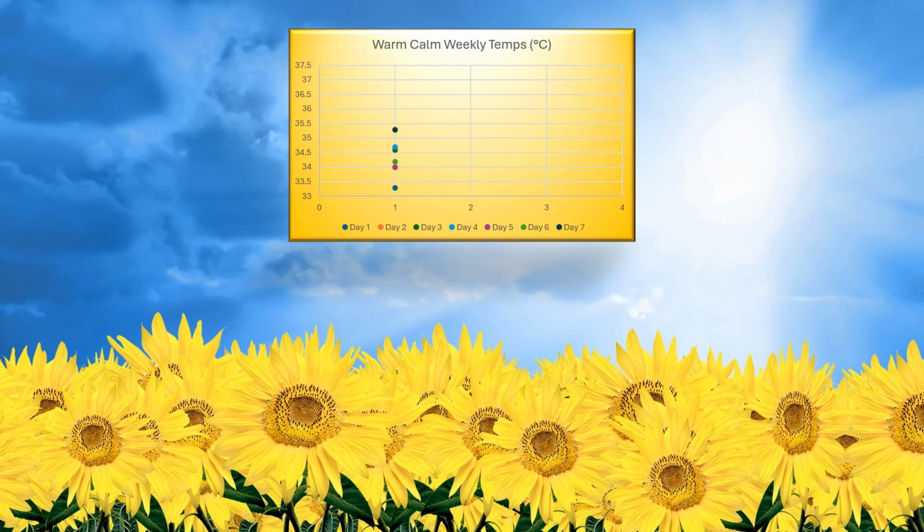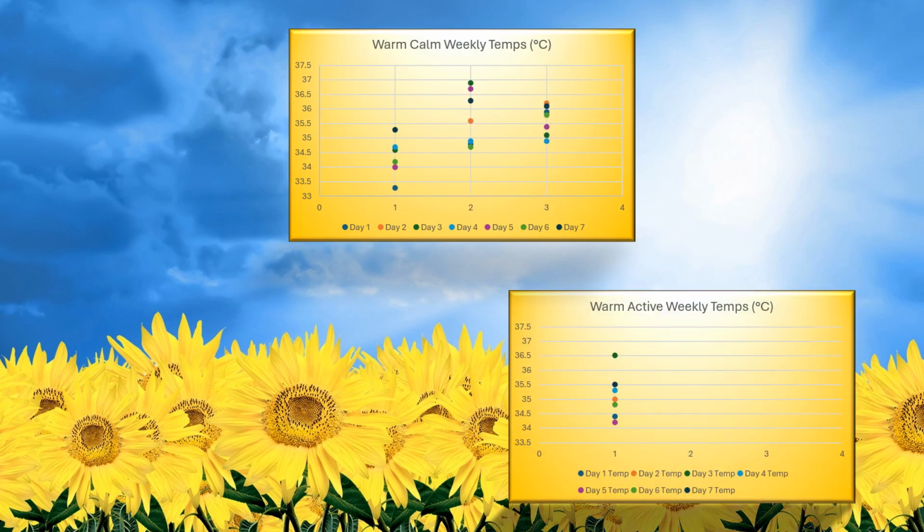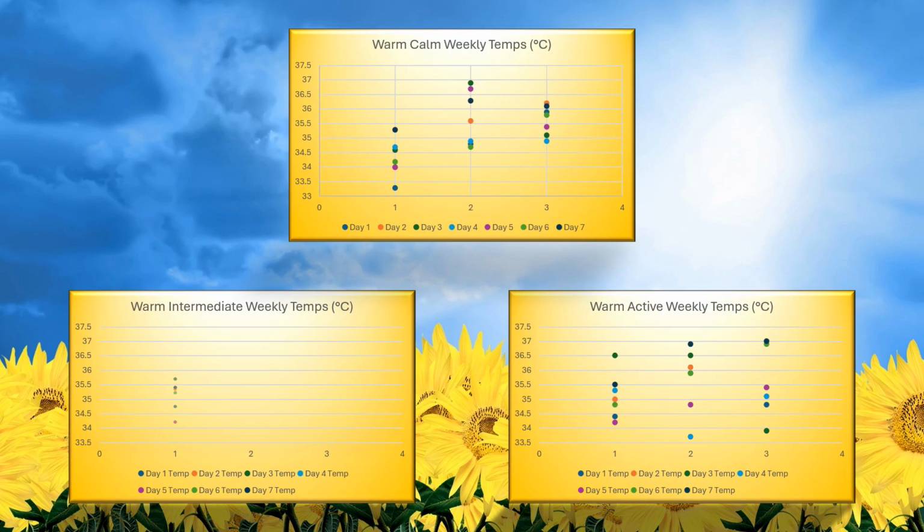Here are all the temperatures. Not too important, but it's a good idea to see what they were like. With a hot water bath, I will definitely say it's hard to keep a consistent temperature.